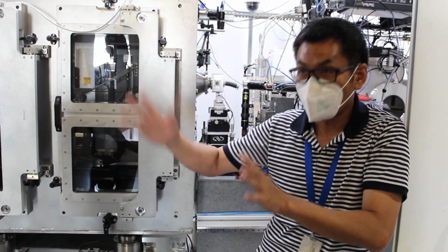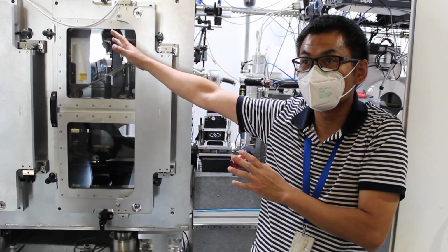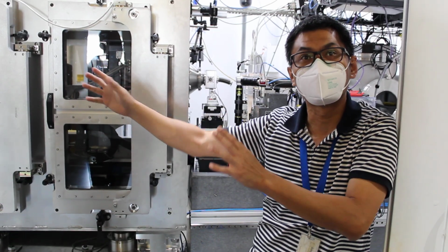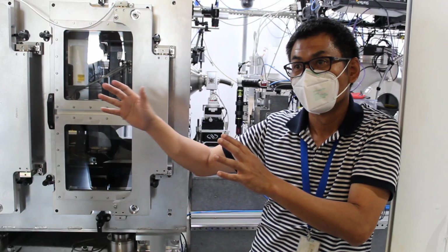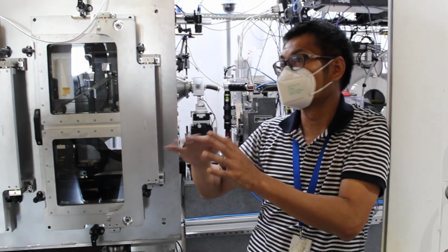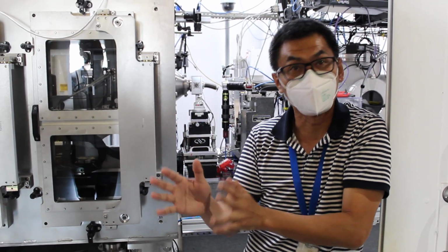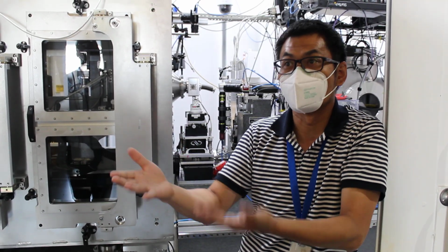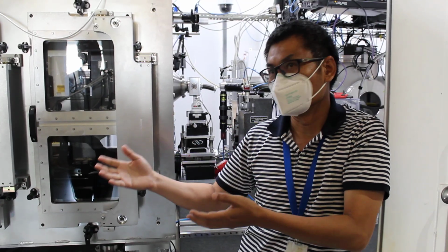And for that kind of information, you can combine it with what you get from crystallography, or maybe from cryo-EM, because those techniques give you a very high resolution structure. But in those techniques, what you see is sort of a frozen structure. Here you're studying the structure in solution, so the molecules are still free to move around, and that's how they're supposed to be in real life. So in a way, it's a more realistic experiment.